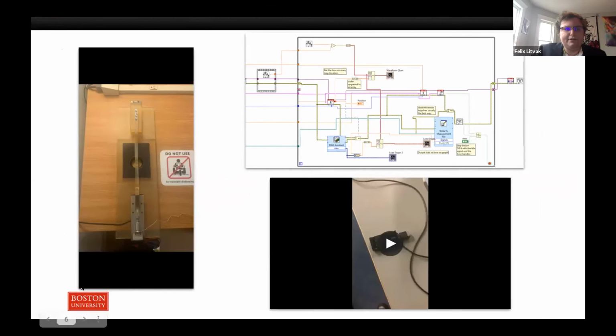So over here on the left, you can see the image of our completed device. The middle part is an insert that can be removed. The center part of this insert is a Petri dish, which is glass and allows for imaging from the bottom of this device. These are the grip clamps, which move to stretch the tendon. The tendon is attached in the center, and the motor and load cell are located right here. So this is the grip clamp that moves.